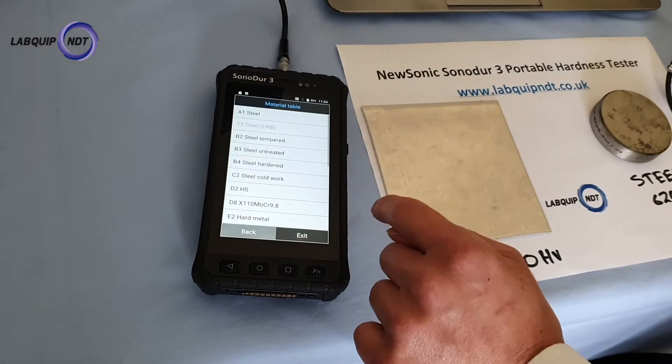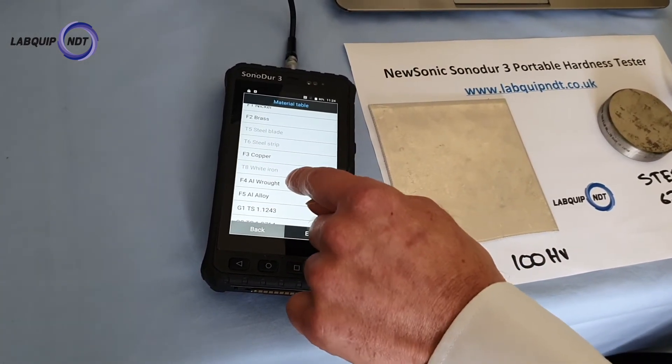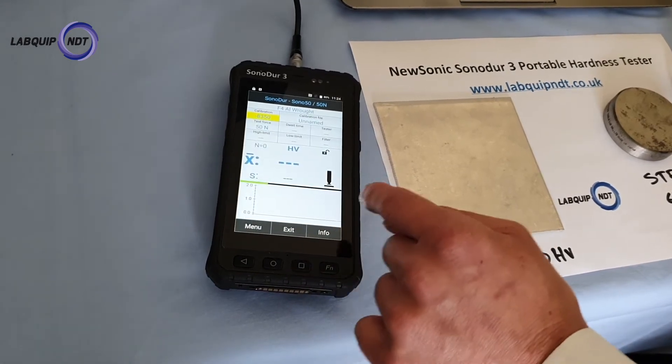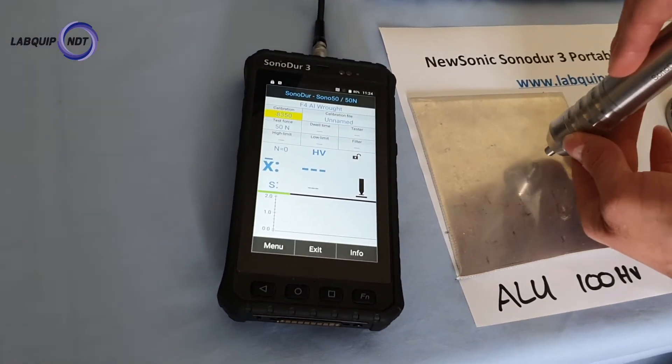So I'm just going to switch to aluminium to test this sheet of aluminium. It's a 3mm sheet, commonly used in automotive applications. So here we can go straight onto the sample.